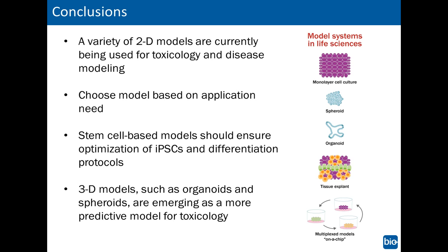Using stem cell-based models, you should make sure that you're starting with optimized iPSCs and differentiation protocols. And if you're looking for more predictive models, you should consider looking at the newer development of 3D model systems such as organoids and spheroids, which are becoming even more popular as more predictive models for toxicology. And with that, I think it's a great spot to hand off the reins to Kevin Flynn to discuss more in depth about 3D models and some of the tools that Bio-Techne has in that space.